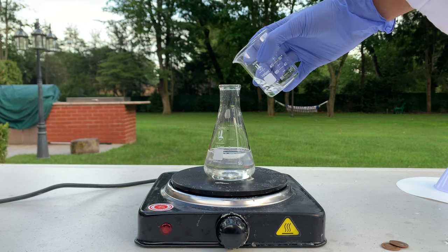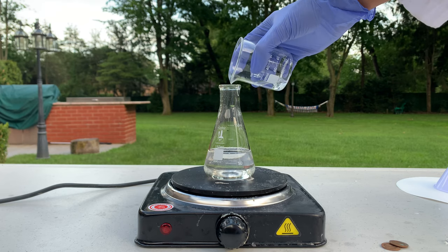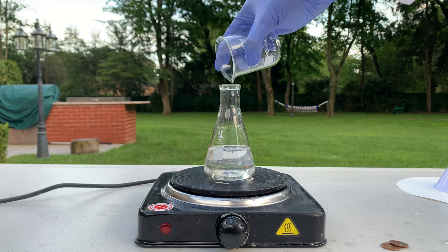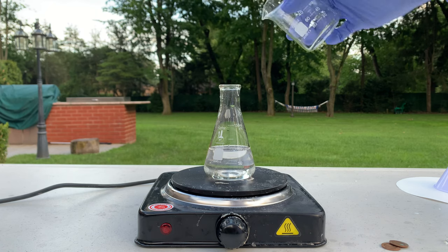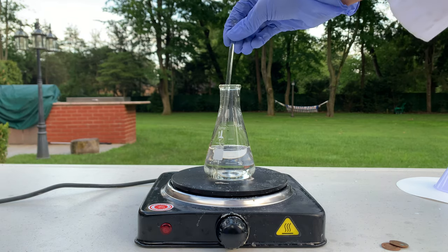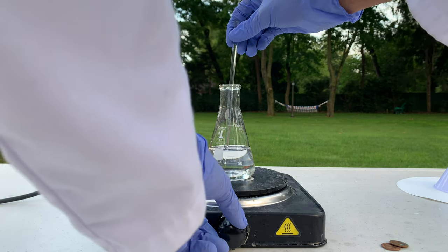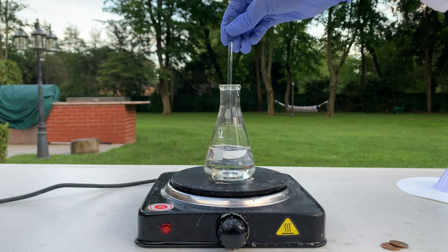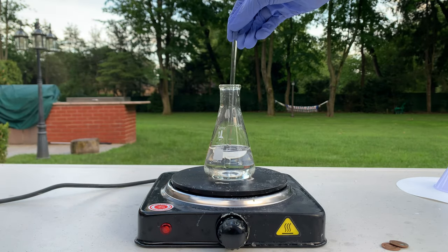You want to add the vinegar slowly. Now we have our solution of hydrogen peroxide and white vinegar, and we're going to mix this and heat it up until it reaches a boil.